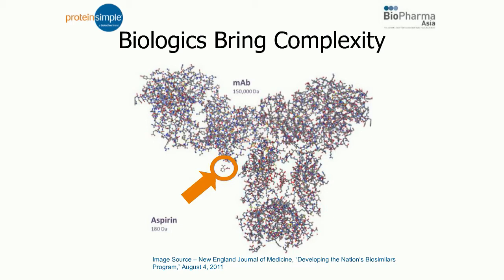Historically, particle analysis had largely focused on external contamination or physical contaminants from the manufacturing line, which could contaminate the drug products. But now we have to deal with particles that are potentially a product of the drug formulation or product itself.